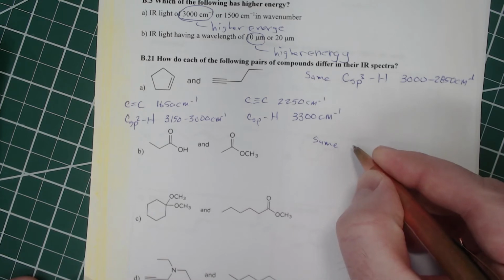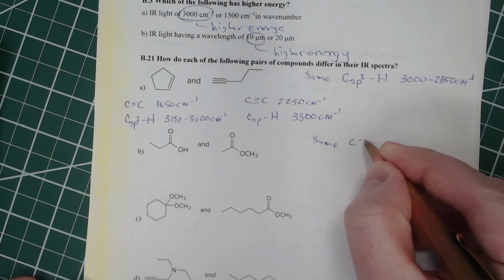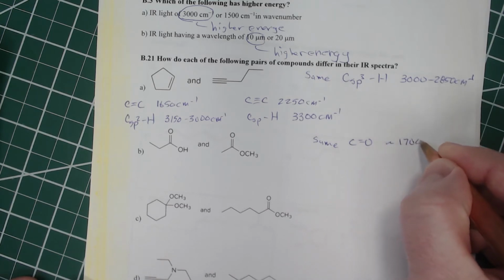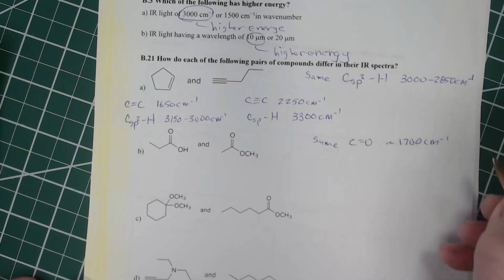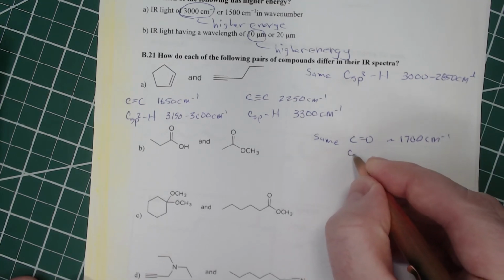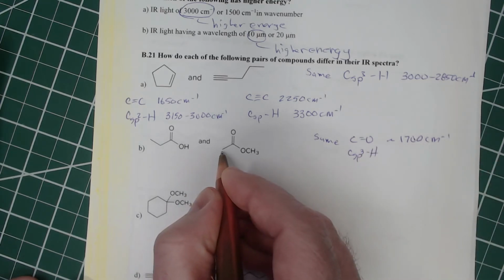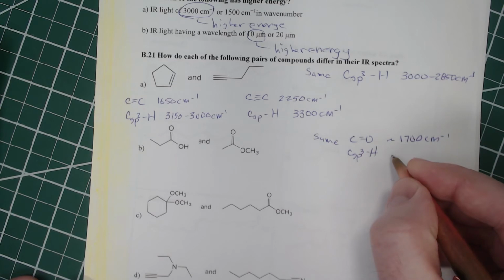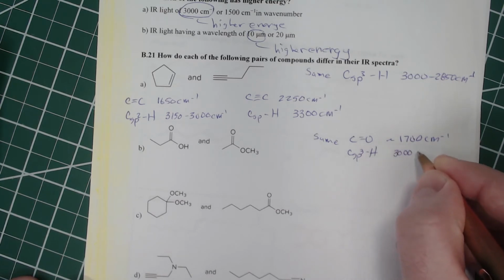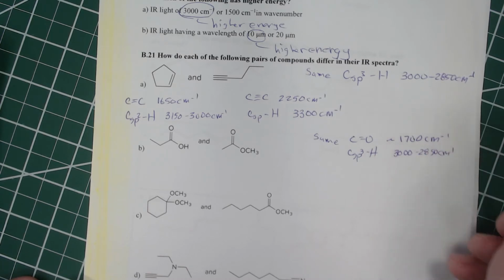So the same for both of these, they're both going to have a carbon-oxygen double bond, which is at about 1,700 reciprocal centimeters. And they will both have carbon sp3 hydrogens, right? Because there's a methyl and ethyl, all right? And those are going to be, again, at 3,000 to 2,850 reciprocal centimeters.